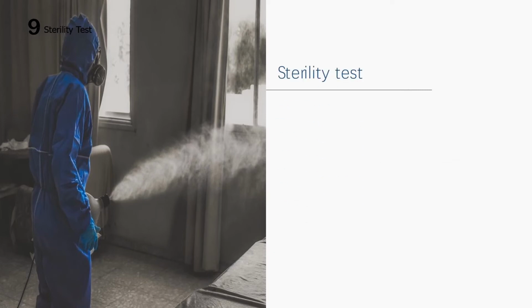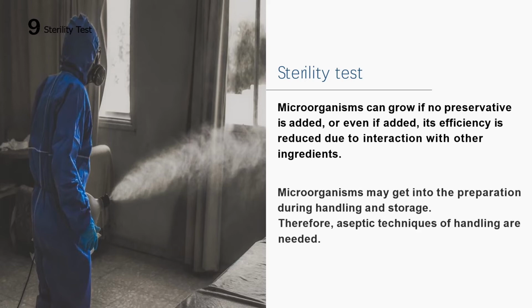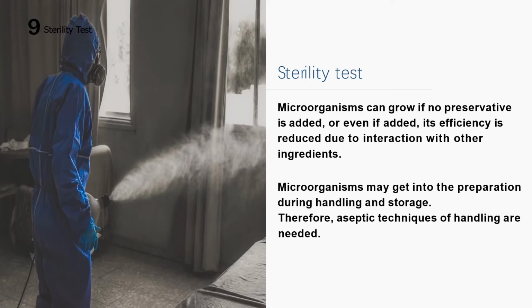Sterility test. Microorganisms can grow if no preservative is added, or even if added, its efficiency is reduced due to interaction with other ingredients. Microorganisms may get into the preparation during handling and storage, therefore, aseptic techniques of handling are needed.